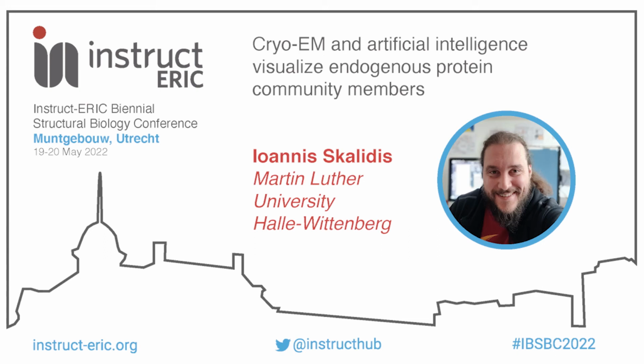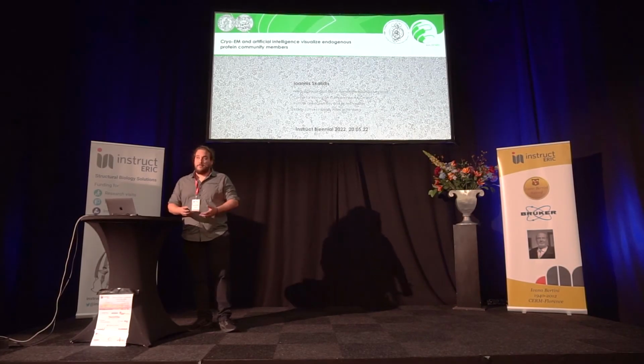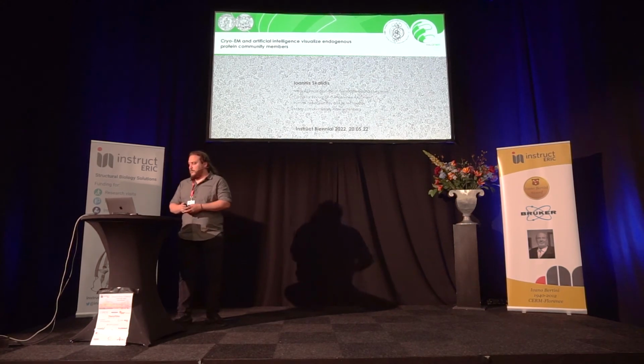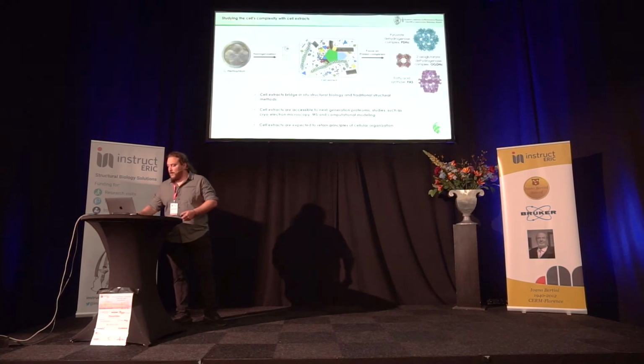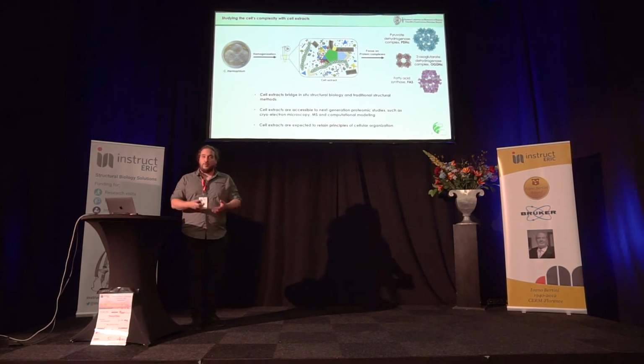I'm going to present some things about how we can employ cryo-electron microscopy and artificial intelligence to help visualize endogenous protein community members. But what are endogenous protein community members? First of all, I have to give you some background, and for this, I have to introduce our lab's methodology.